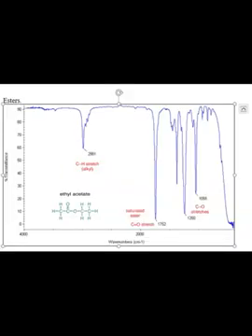So why is this one useful? A couple of reasons. First of all, this is not a carboxylic acid, right? You need an OH group. Acids always end up on the end of the structure, so we don't really have that. But we do have a carbonyl group, and that's easily found right here, that C double bond O. Saturated ester means there's lots of hydrogens, okay? Alkyl stretch we've seen before. But then there's the C single bond O, and we can see that here, 1055 to 1250.